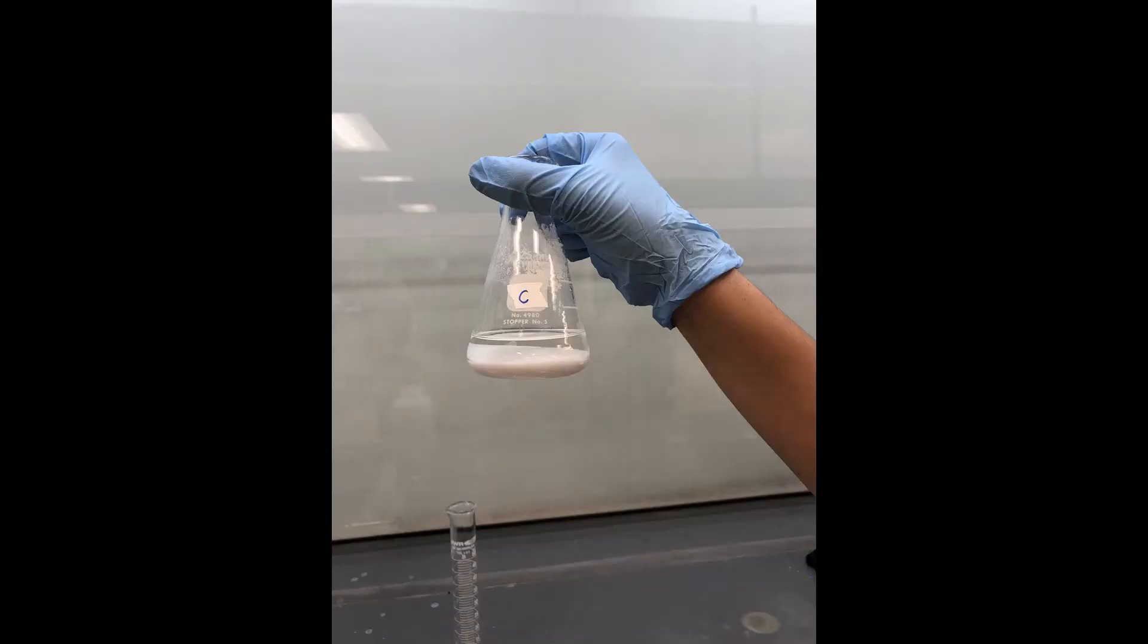Later, you will filtrate the contents of flask C out by pouring the mixture through a glass filtration funnel with cotton into a round bottom flask to be rotavapped later.